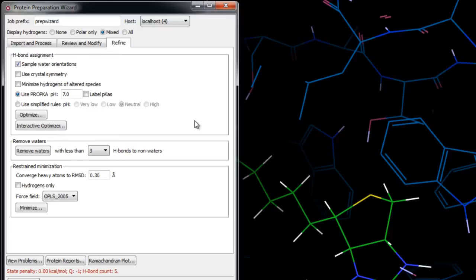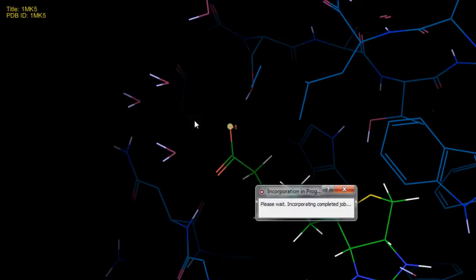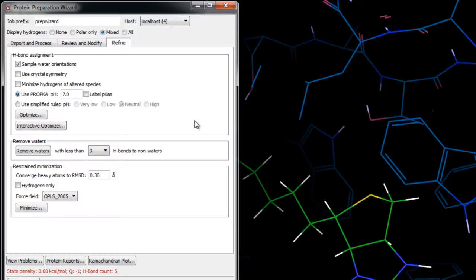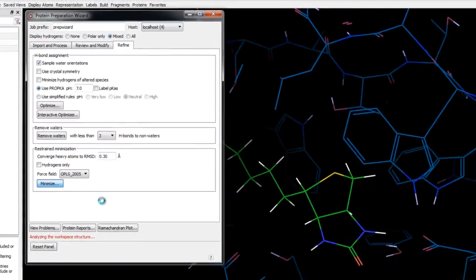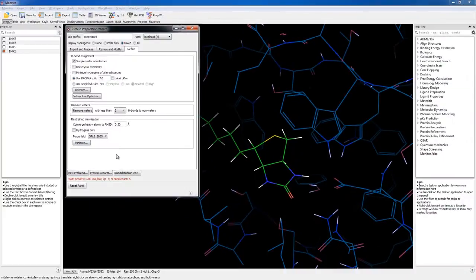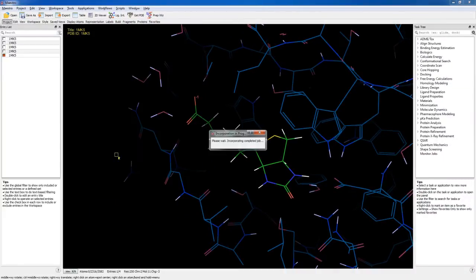Once that's done we'll click Minimize. Here a restrained minimization is performed which removes the atom clashes and relaxes the sidechains and other modifications made to the protein.